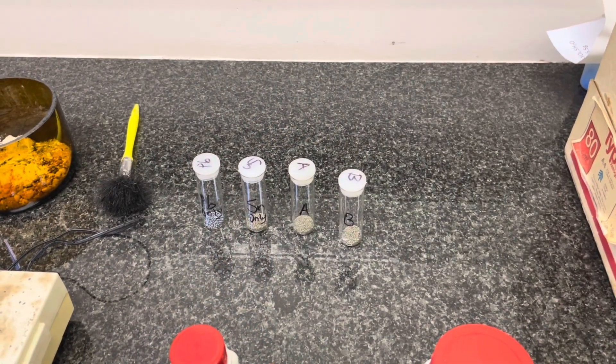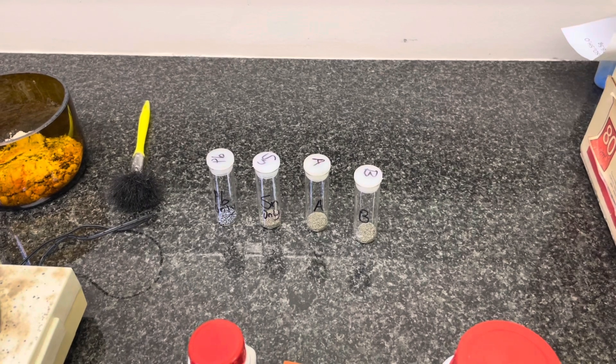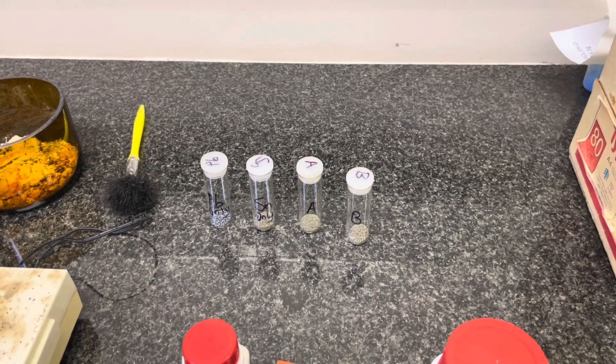You can prepare all your samples — your lead only, your tin only, and your samples A through G — in such a manner.